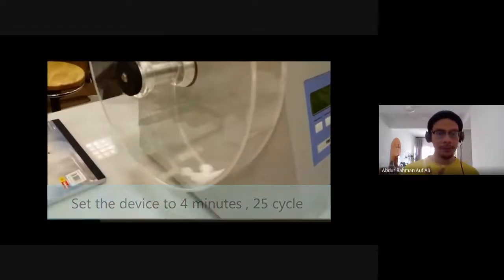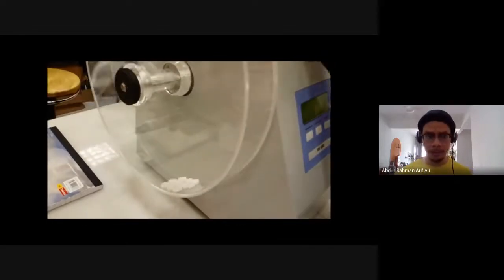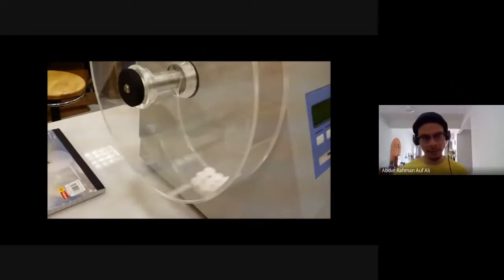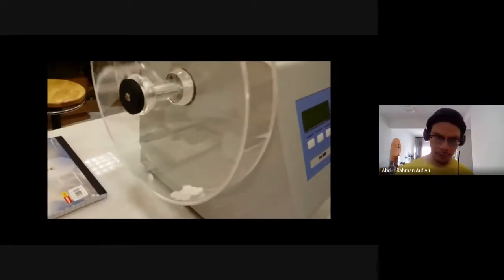Okay, so you are watching a video of an analyst performing a friability test. The objective why we perform friability test is so that we can make sure that the tablets produced can withstand abrasion, vibrations and damages. Because bila kita buat these tablets, we will ship them out to hospitals, pharmacy and clinics all over the world. Kalau bukan all over the world pun all over the country.